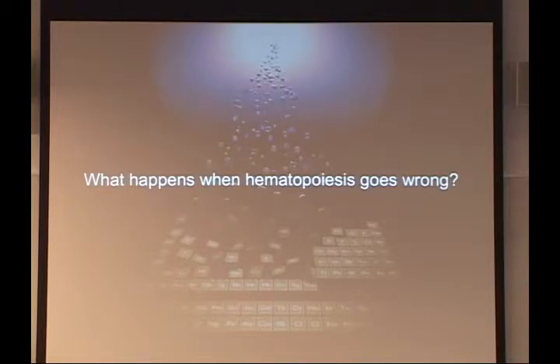So just to give you an example now with the high-dimensional data and these unbiased visualization techniques, and how useful they can be in the case where something goes wrong. We were able to do a lot of that and validate it, making us feel confident to use it as a tool for research and discovery because we were standing on the shoulders of 30 years of hematopoiesis and immunology.